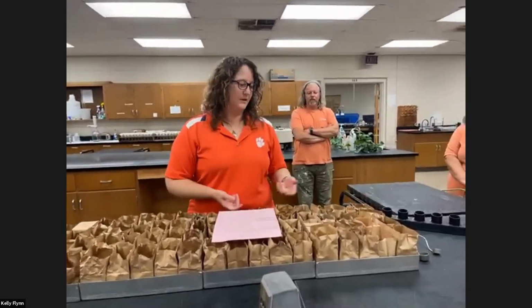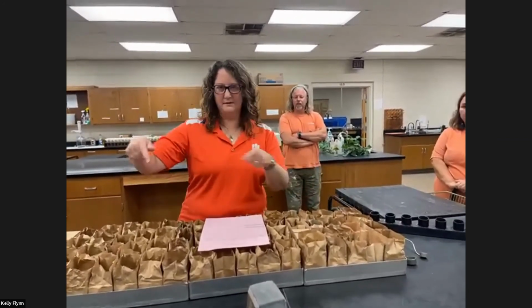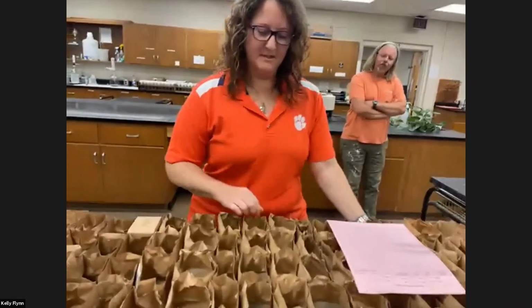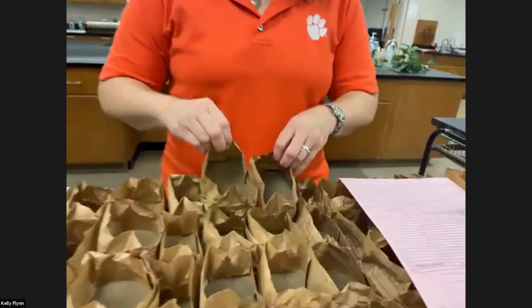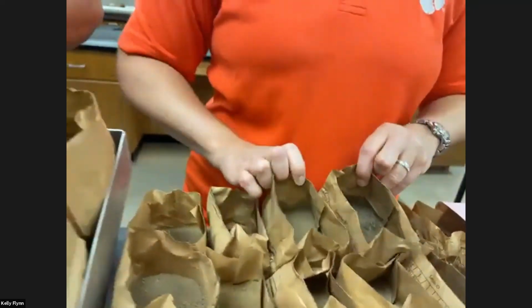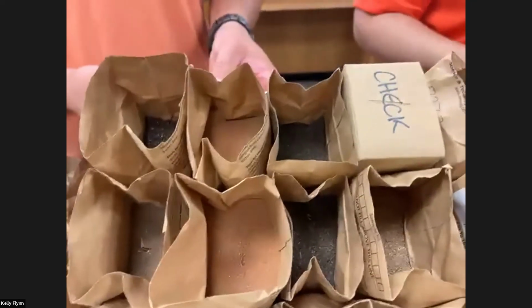They've been dried and ground. And if you were to look, I don't know if the camera can look through. If you were to see some of these samples, they're really finely ground material. And maybe hold up the whole tray. So these have come out of the grinder, and we're going to scoop them for 2 separate tests that we do.